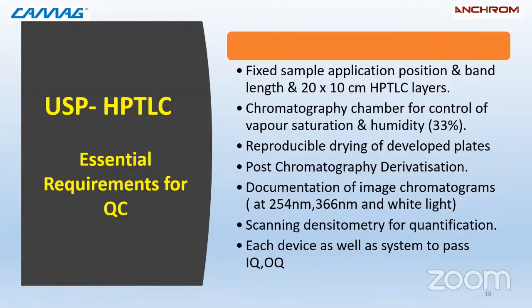Now, what are the essential requirements for QC as per USP? There should be a fixed sample application position and band length. The application and the development should take place under controlled conditions by using a suitable device.